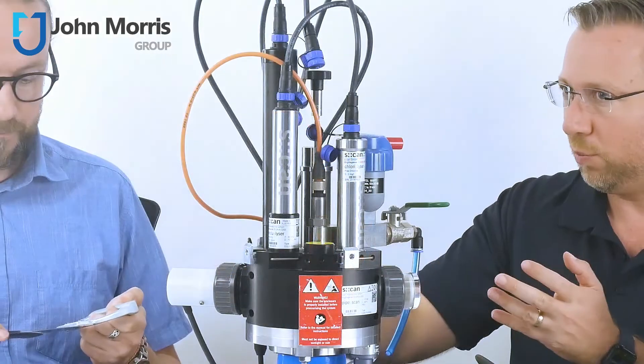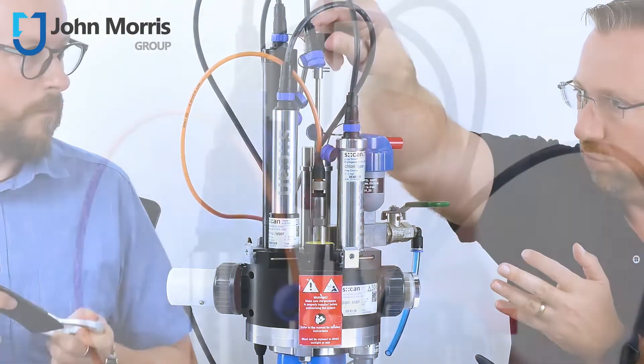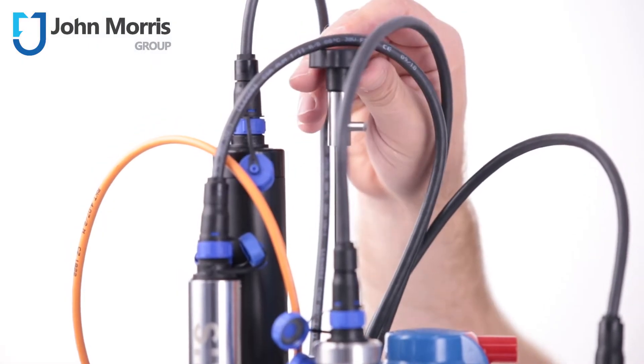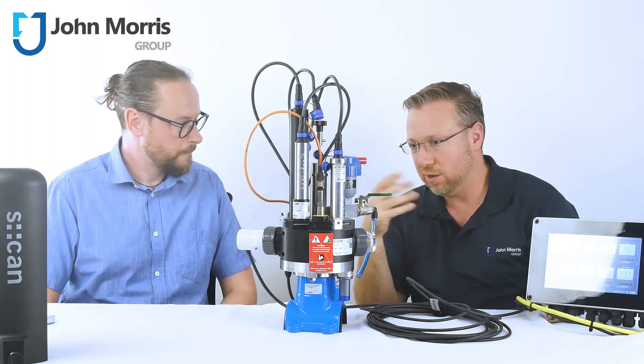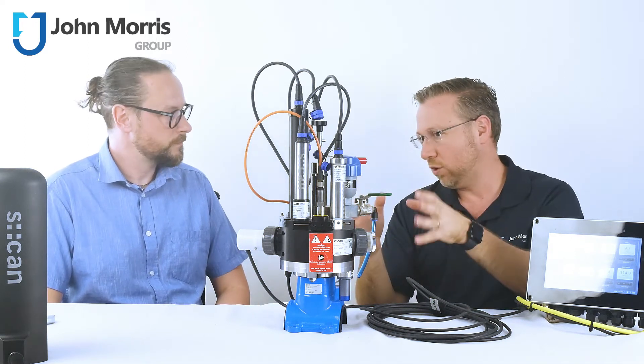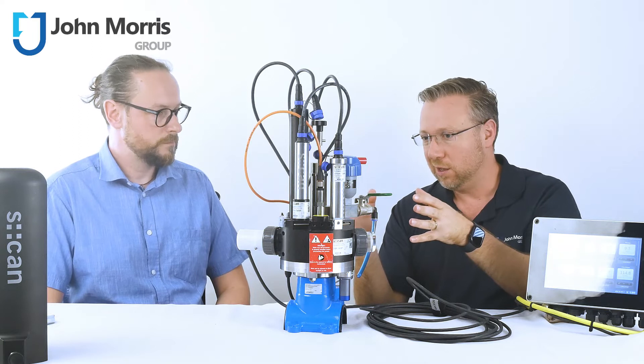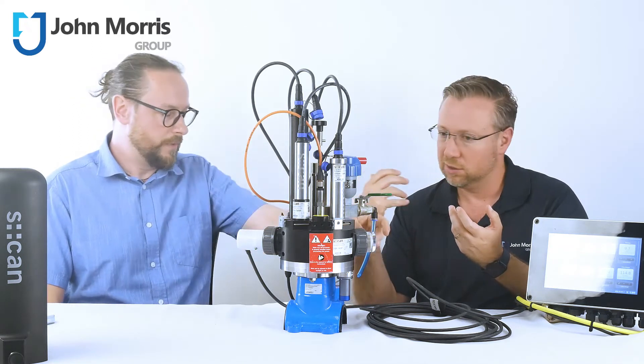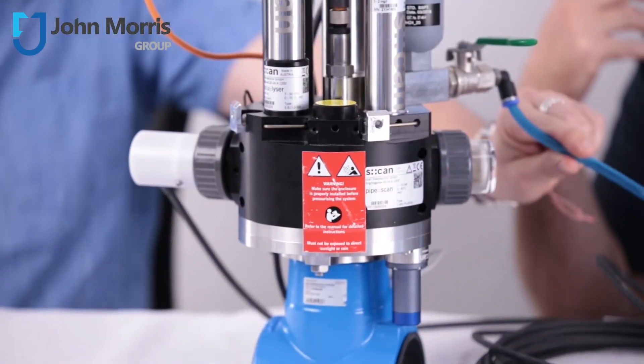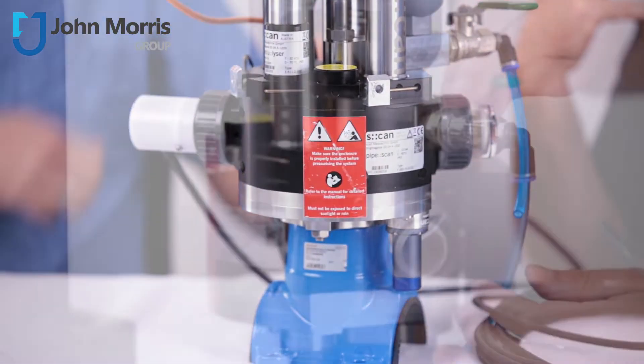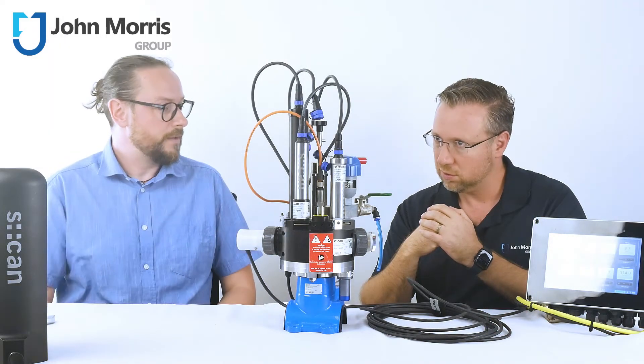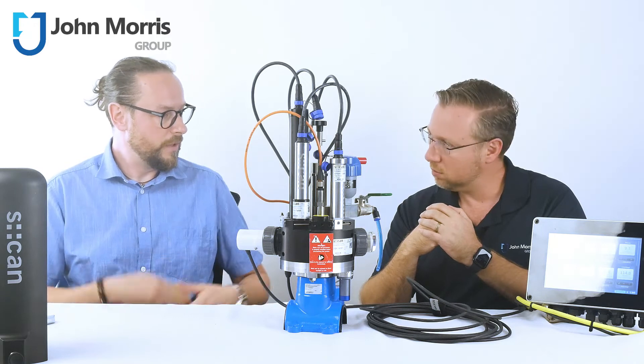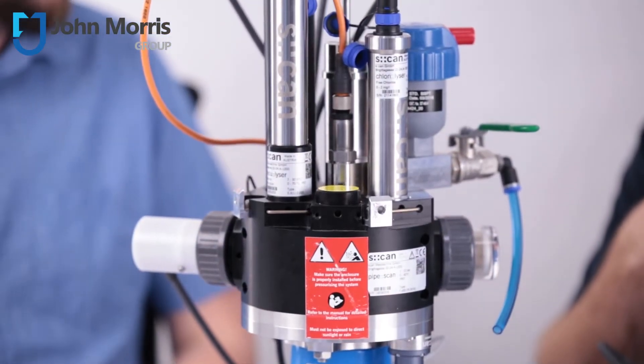Right. So you remove the blade and then you push down this zipper system back into the pipe? Yes. Right. Okay. And so let's say that I don't trust the readings that are here. How could I collect a sample of the water for laboratory analysis? Yes, so therefore we have a possibility in this place so you can take a sample actually from the same water you measure in this moment, and then you bring it to the lab and then you have a reference value for calibrating or whatever you need.